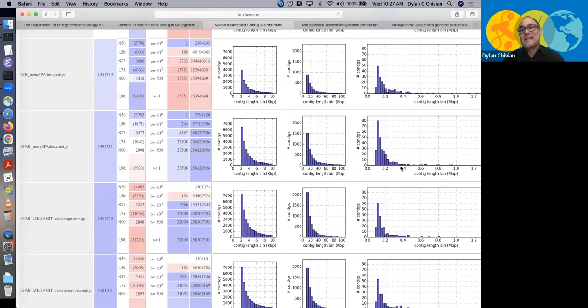And this isn't necessarily valid, in terms of metaspades tends to optimize joins with less support, let's say, than the other methods. So it's possible that we're getting false positive joins just for the sake of having longer contigs, but maybe, because it's doing more joins, some of them are true positives as well.